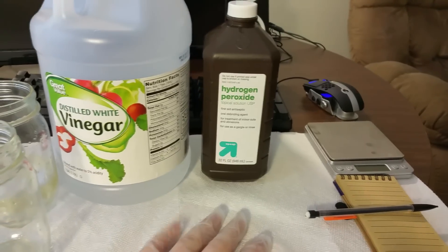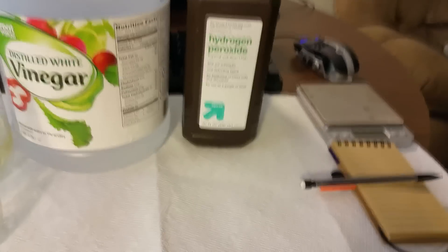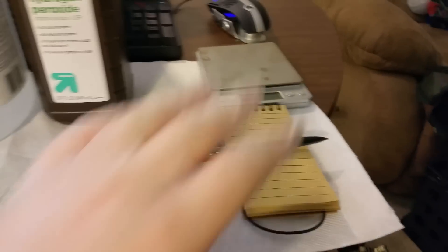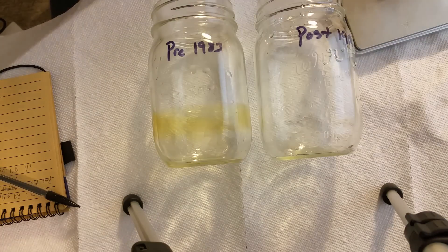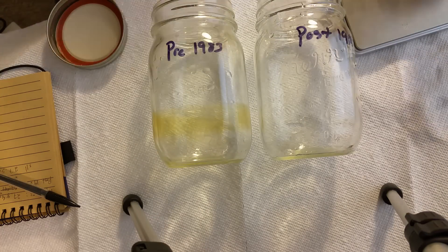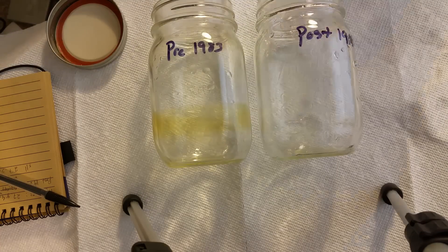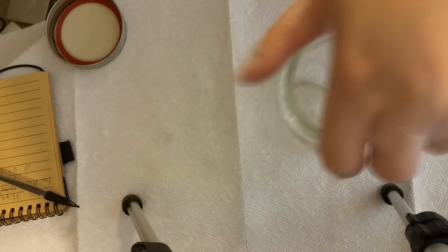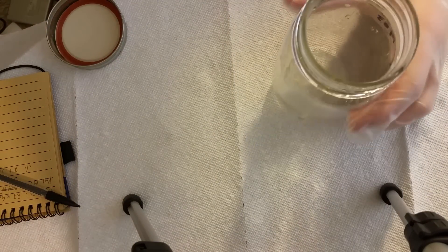You have two beakers — one filled with 1983 and before pennies, and the other containing modern pennies. Both beakers were filled with about 27 grams of pennies, then filled with equal parts distilled vinegar and 3% hydrogen peroxide. What you should see is the evolution of oxygen gas as the reaction proceeds. These two solutions were then allowed to sit overnight.